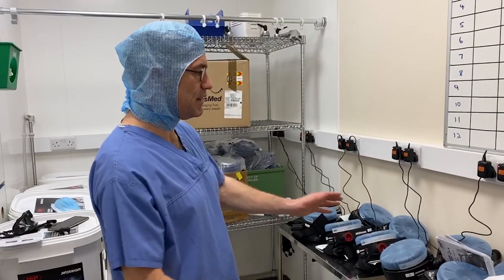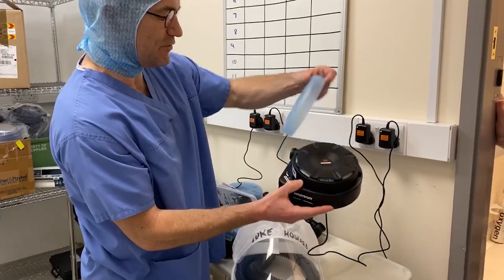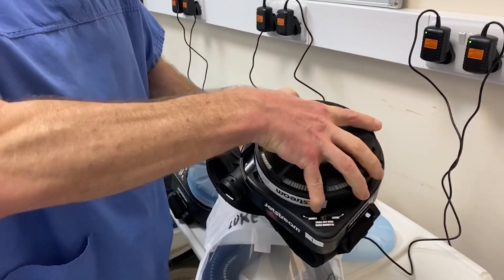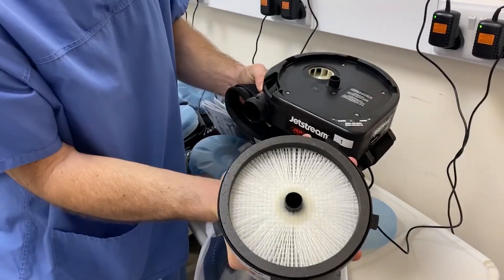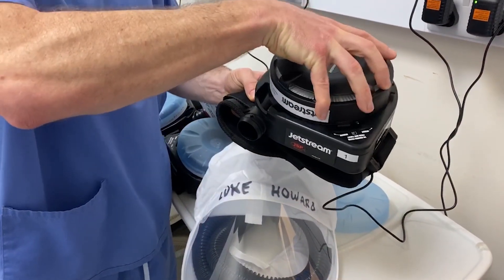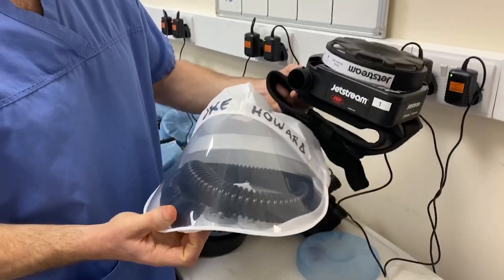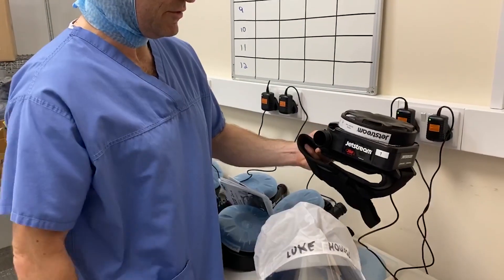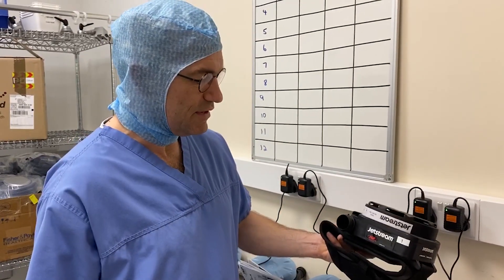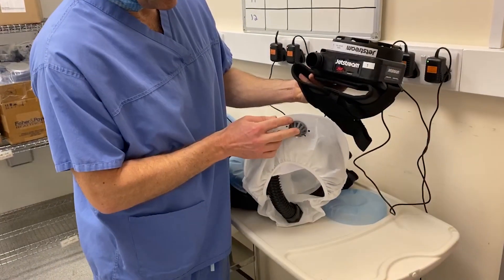As you can see, we've got 12 of these lined up here, all charging. You wear it around your waist — here's the belt — and there's a filter here which draws air through at 180 litres a minute and then pumps that out through the hood, which has got a tube that connects up to this. So it filters the air and passes it over your head at 180 litres a minute, and vents out through this port here.